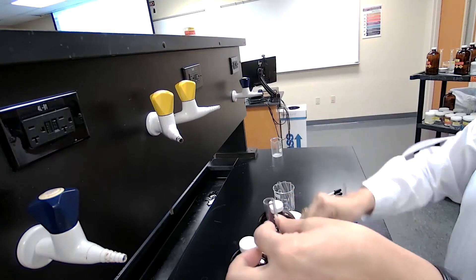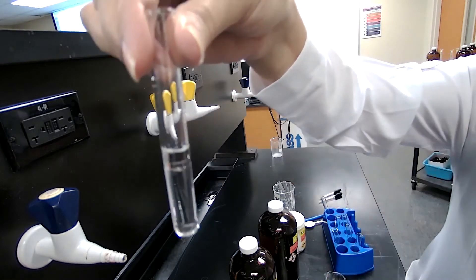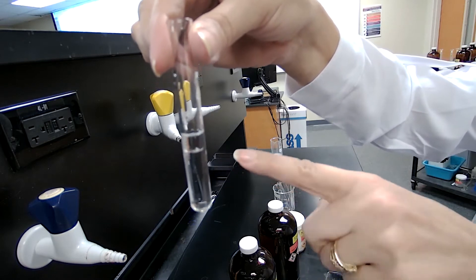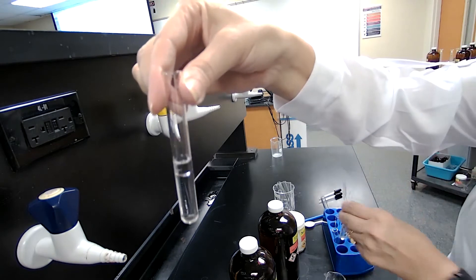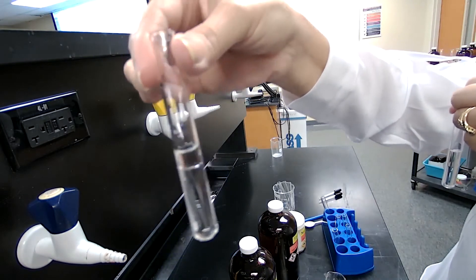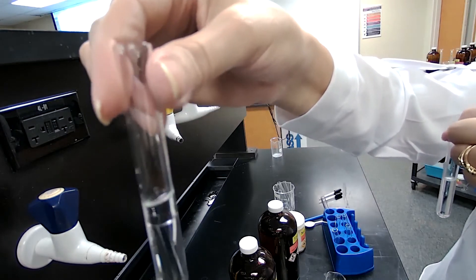When you mix the hexane with water, even though the line is kind of faint — it's not very easy to see — if you look closely it would be different from the acetone-water mixture. You are going to describe what happened: if it was miscible, if it did dissolve, or if it did not dissolve.